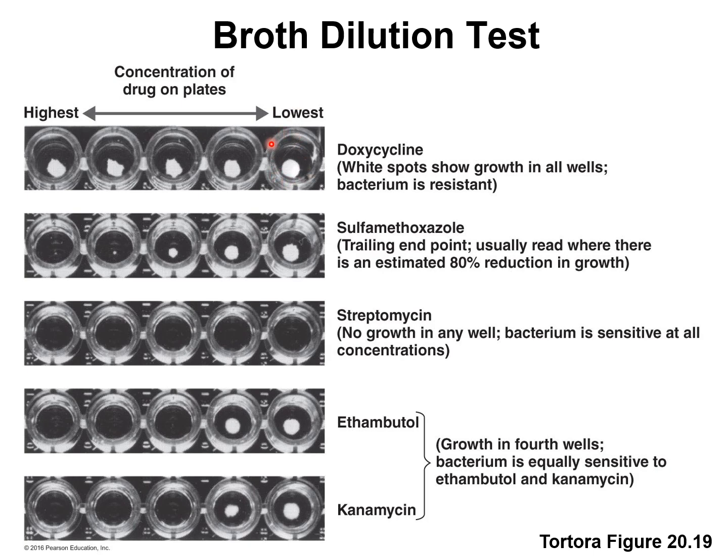We've got the lowest concentration here on the right, and then higher concentrations going over to the left here. The white dots indicate that you've got growth of the bacteria. If you take a look at these different antibiotics, the lower the MIC means you're going to have a more effective antibiotic.